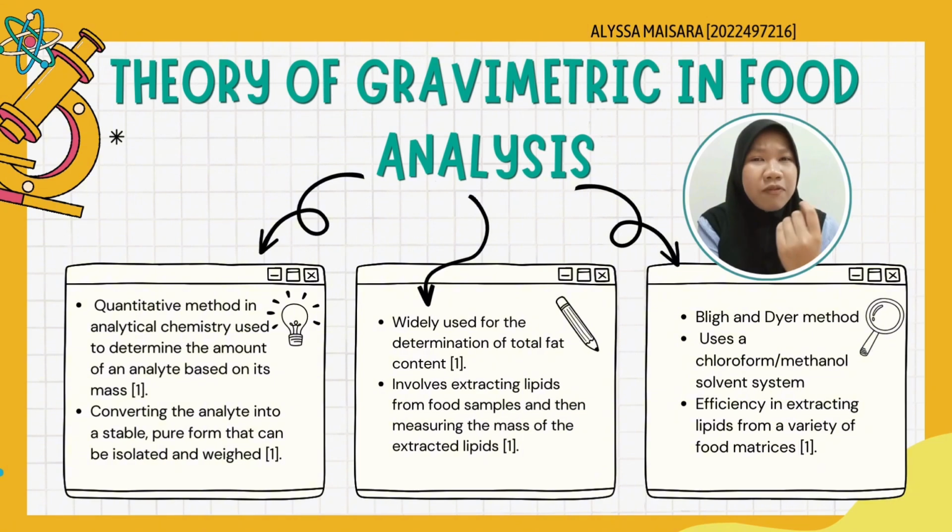The proposed modification to AOAC 983.23 aims to reduce labor intensity and increase sample throughput, such as batch analysis, accuracy and precision, recovery rates, and quality control. The modified method was validated through analysis of total diet standard reference material SRM 1548, which is routine assays of over 600 foods composite for clinical feeding trials and repeated assay of a quality control composite over 2 years.